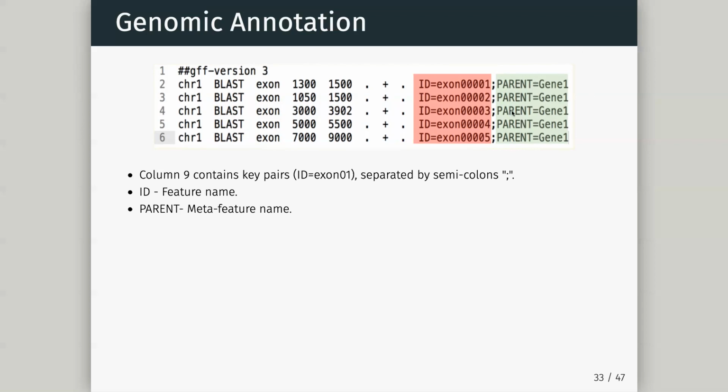That means that when I go and use this in RNA-seq counting, I know to add up all the scores across these exons and place them into one value per gene. Simple as that. It also means when we load this into IGV, it's going to know to connect those exons together.